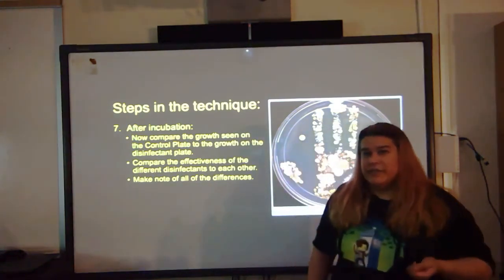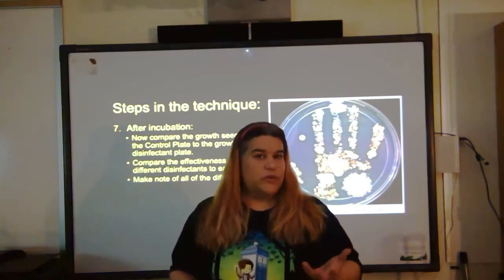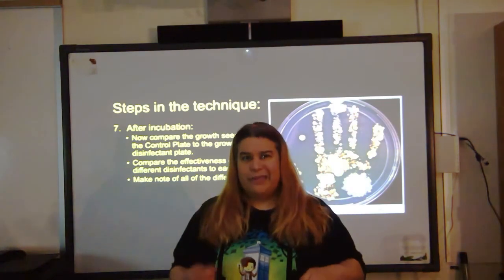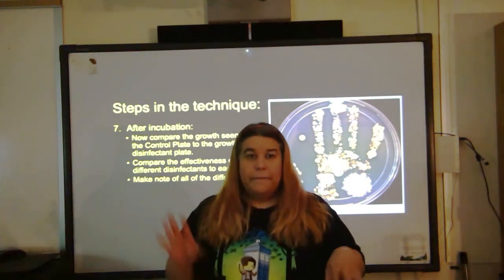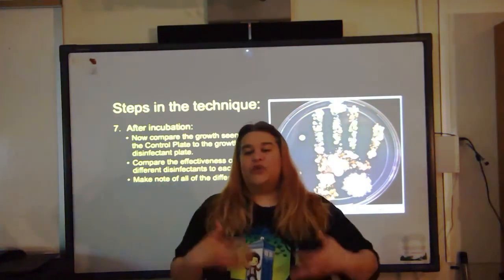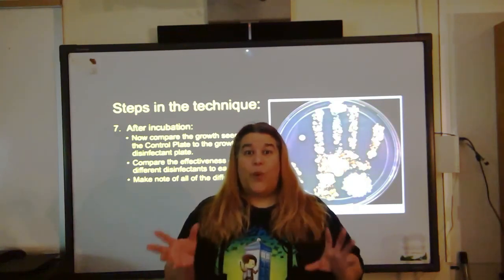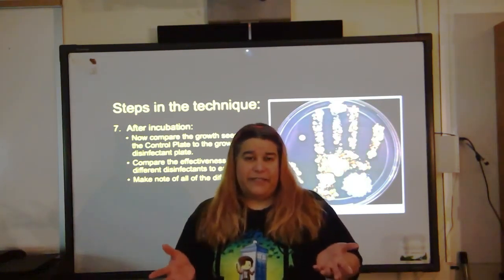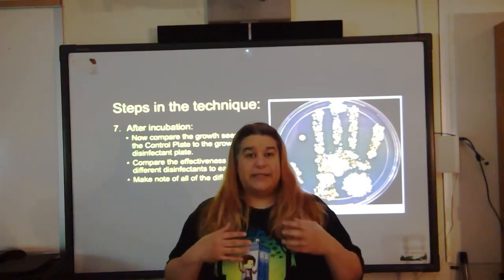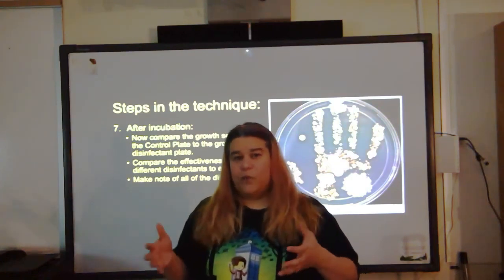Make note of those differences. If you don't look at the results and take notes on those results, there's no way for you to go back and go, oh yeah, this worked better than that. This is what we're doing this week. Again, the actual putting together is not really difficult. The wait is a bit difficult because you kind of want to know, but once you have it, it's looking at it and actually making comparisons. That's the part that takes a while.